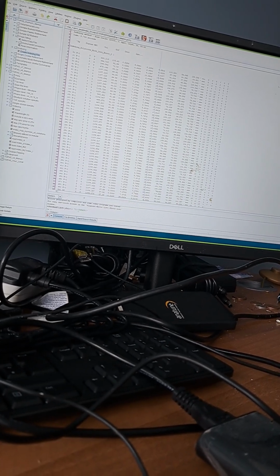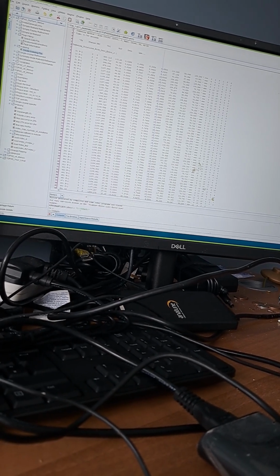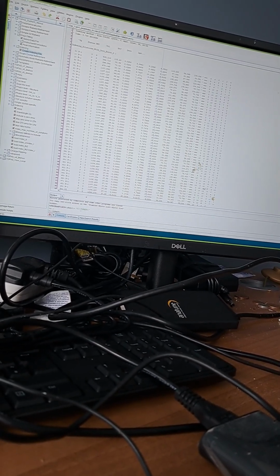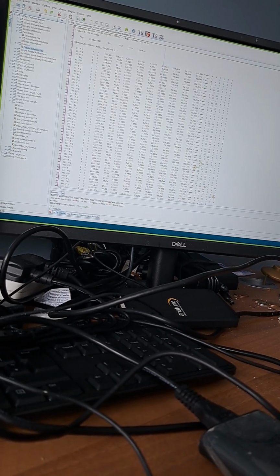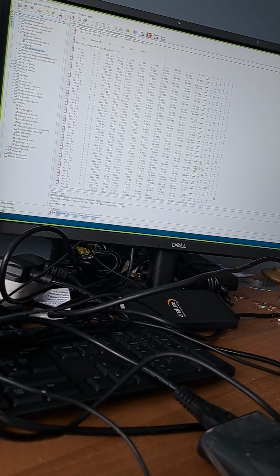So say, for example, if you do epinephrine hydrochloride, let's say you just put that CIF file in, there'll be two components. One of those components will be epinephrine. The other will be the chloride ion. So you want to delete the epinephrine, leaving only the chloride.